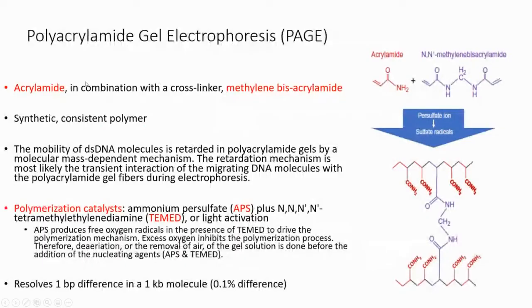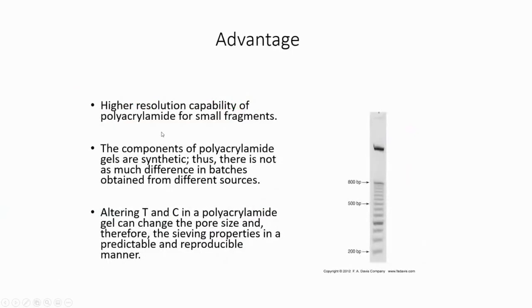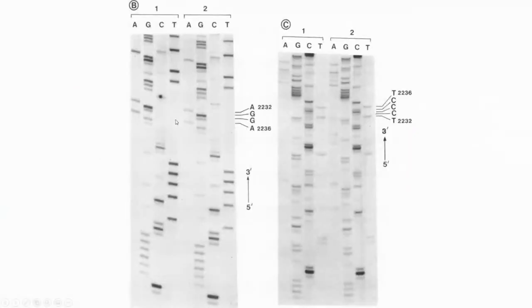For the polyacrylamide gel, you normally will see this kind of expression. It's a high resolution. As you can see, these are sequencing gels. You can see these are single nucleotide resolution.